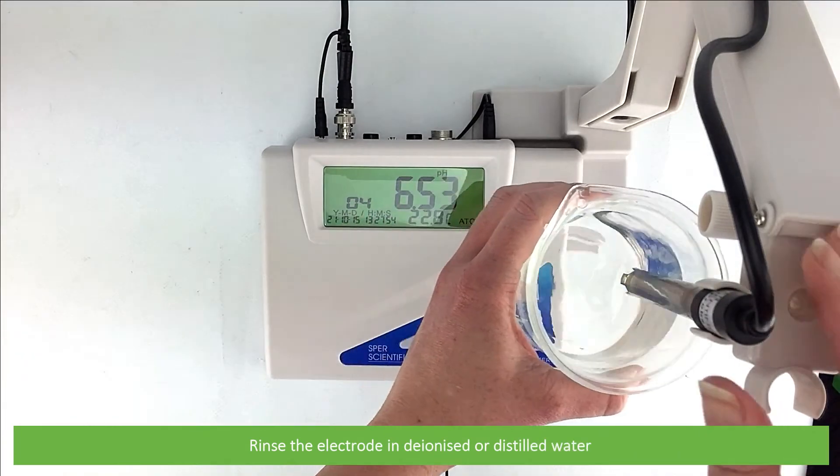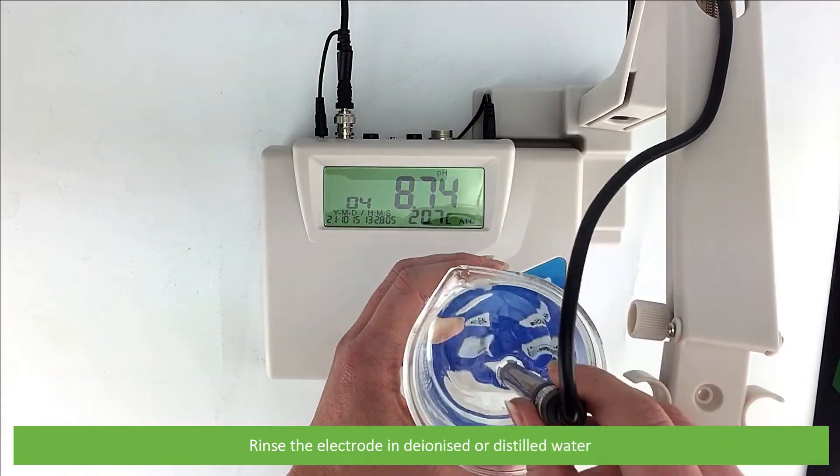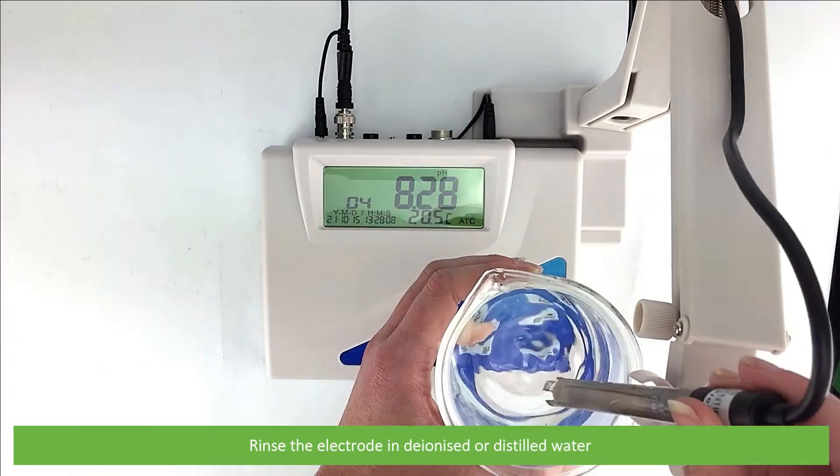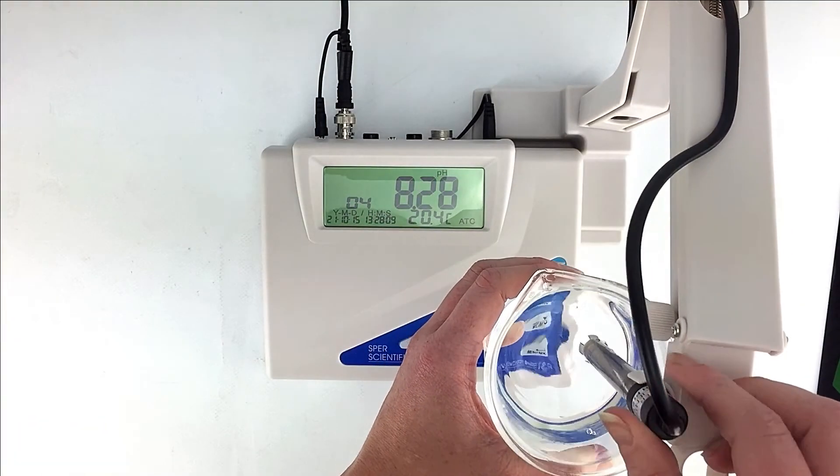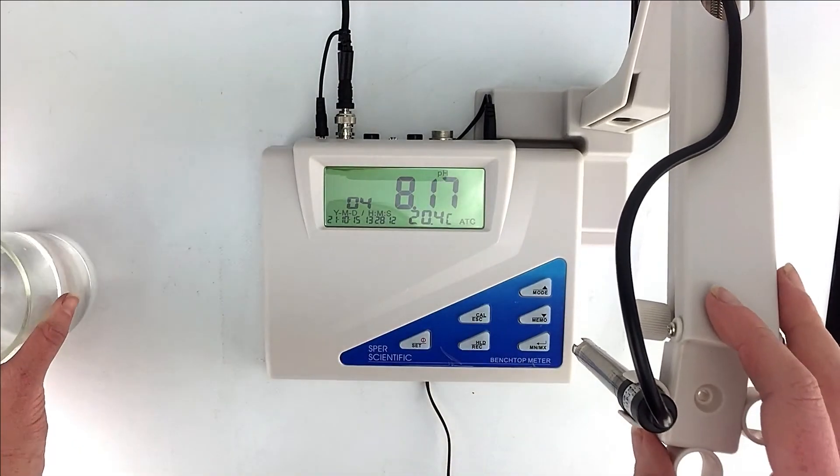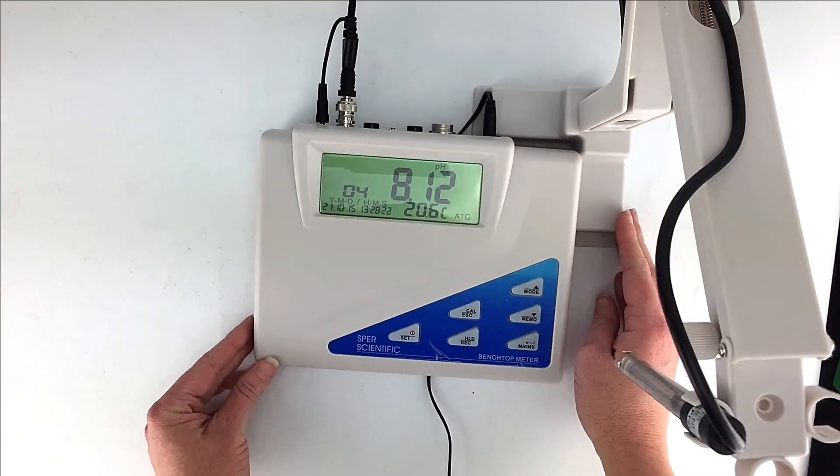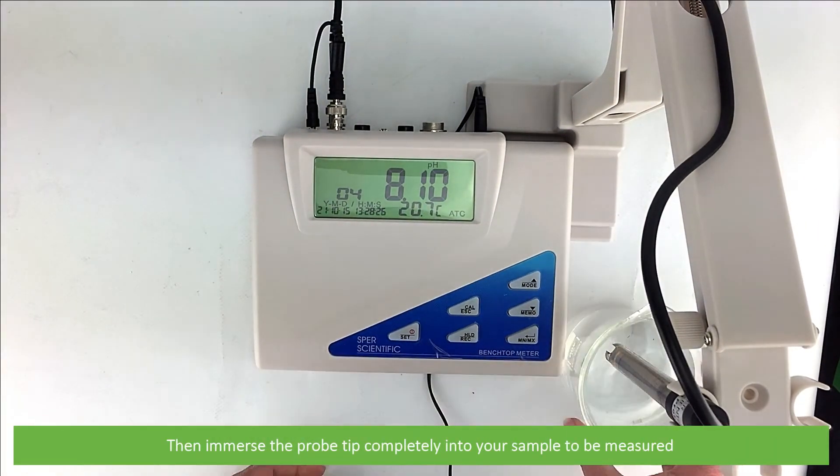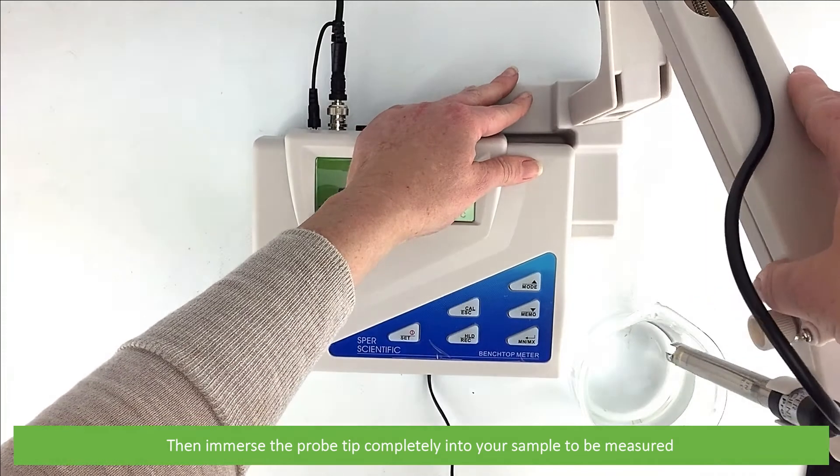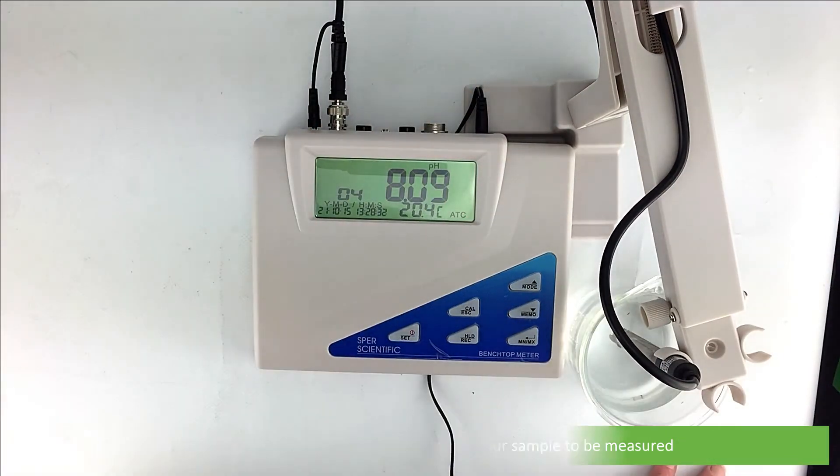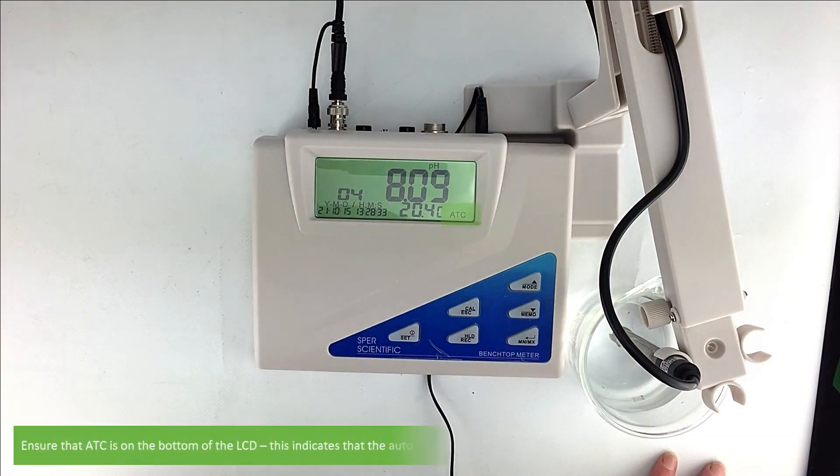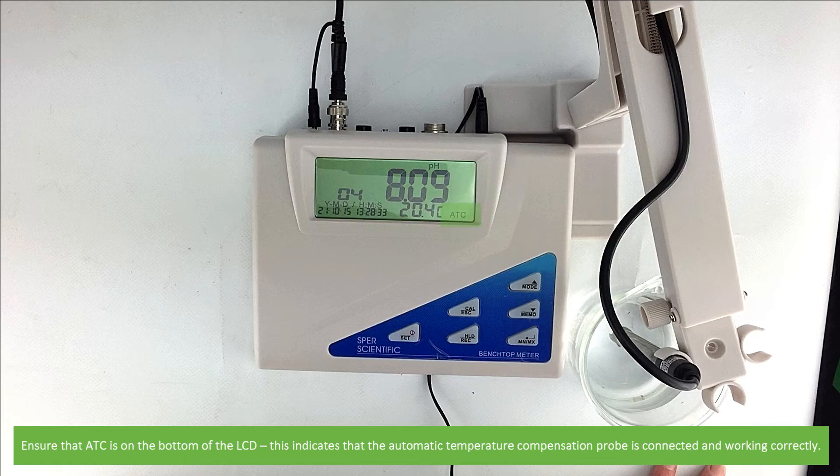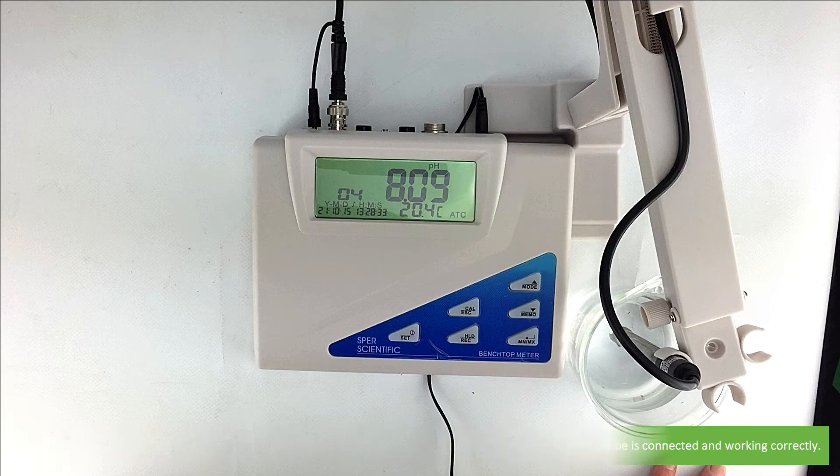Rinse the electrode in deionized or distilled water. Then immerse the probe tip completely into your sample to be measured. Ensure that ATC is on the bottom of the LCD. This indicates that the automatic temperature compensation probe is connected and working correctly.